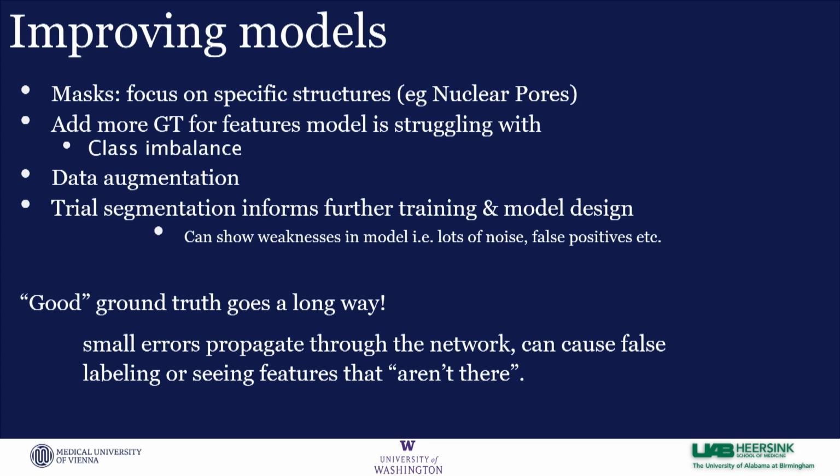I've done a lot of fidgeting around with that and experimenting: what's useful, what doesn't really help that much, or certain augmentations really slow down the epochs of the training, and it might be useful in the long term or later on. But just to quickly get started, if you just flip and rotate the data like 10 times, you'll get pretty good results right away for starting.